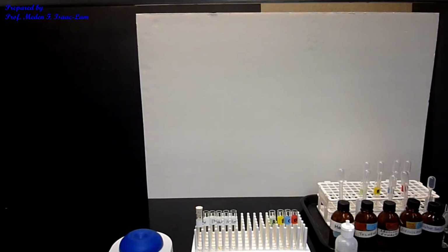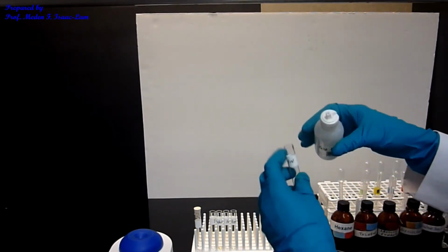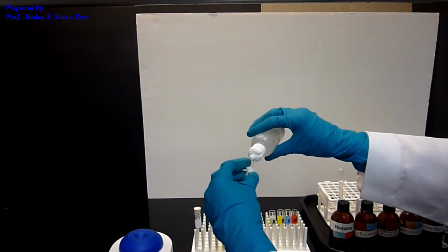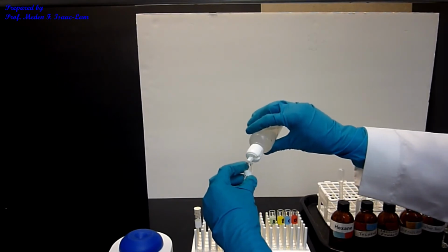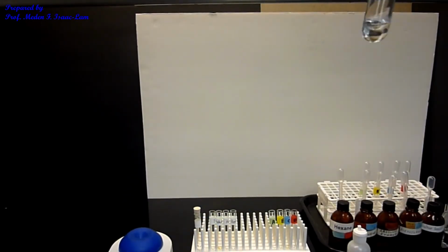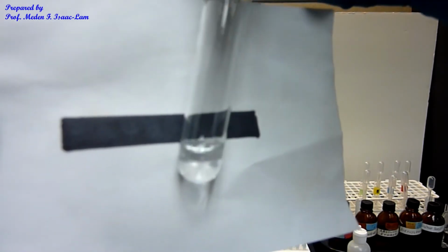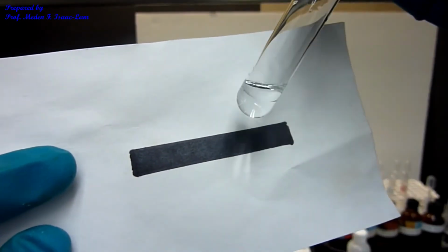So now I'm going to do the next one, which is toluene. So again, 6 molar hydrochloric acid, 8 drops. So actually, let's mix it up. Okay, so now you can see better, okay? So what do you observe? Okay, so write down the observation.